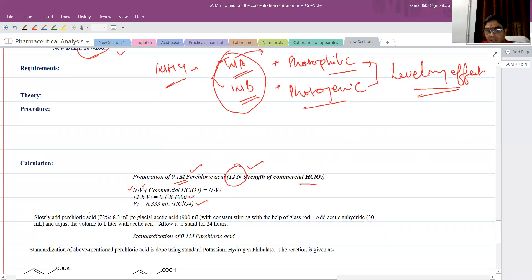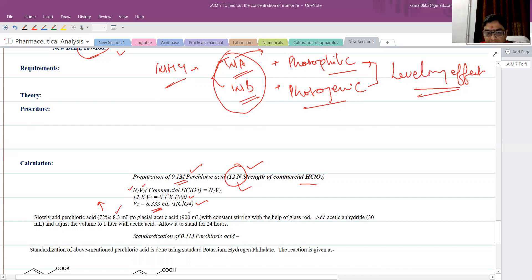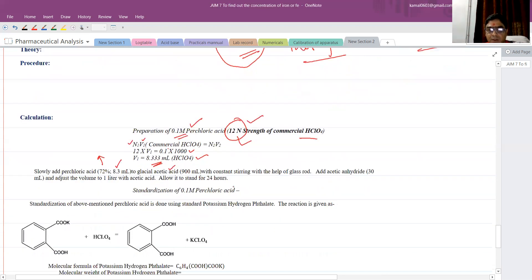When you see the literature, it states that this perchloric acid solution available commercially is 72%. That means 72 grams of perchloric acid is present in 100 ml of solution. The remaining 28% may be water. So we will take 8.3 ml of perchloric acid — available in the market at 72% strength or 12 Normal — and dissolve it into 900 ml of glacial acetic acid. Water is not used here, that is why we take acetic acid.